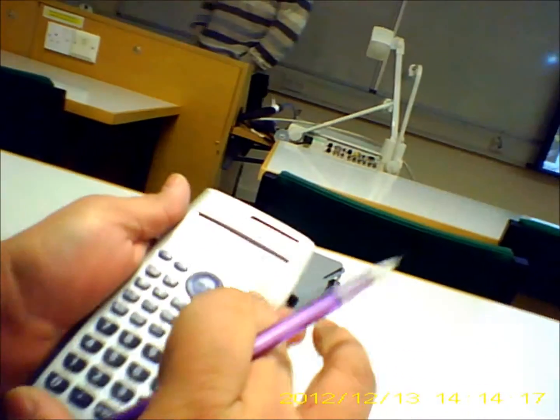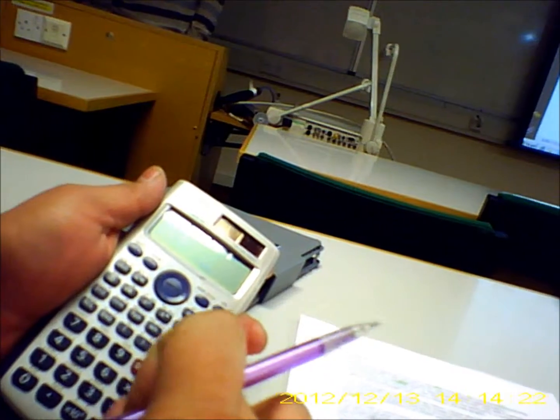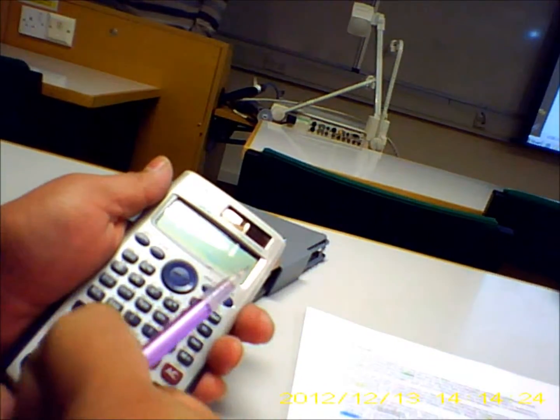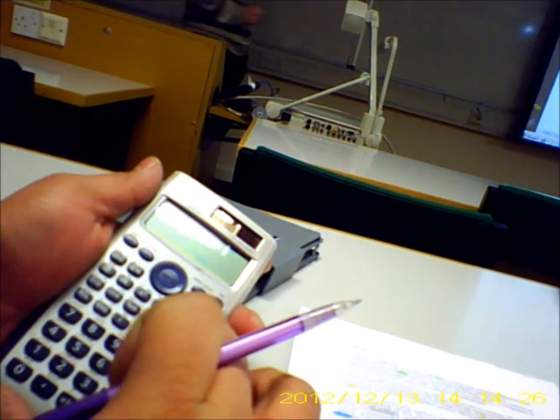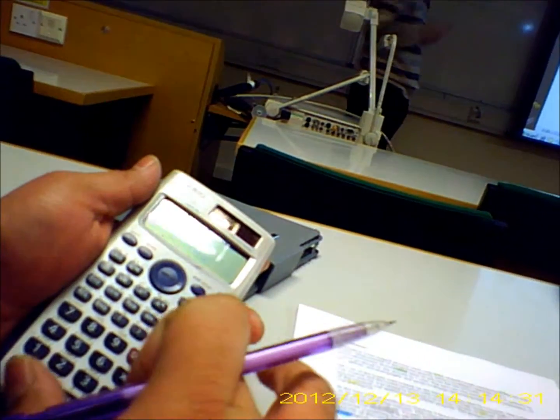with known molecular weight, and you will either get a picture of the gel, and you should be given the size and the molecular weight of the proteins, and you should measure those relative mobilities by yourself, or you will be given the relative mobilities themselves. So this is sufficient data to calculate the molecular weight of your protein.